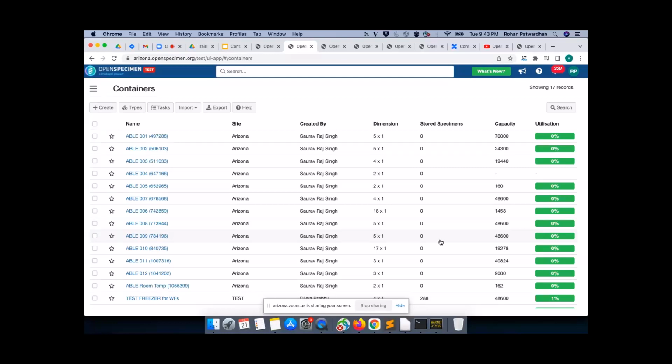So I think we've seen some of the power of those features that we're going to have to utilize. But like I say, changing the definitions in that spreadsheet is an easy way to do it, but I'm afraid it might be an easy way to mess it up if we're not careful. So that's where we're going to have to spend a lot of time learning that system in great detail.